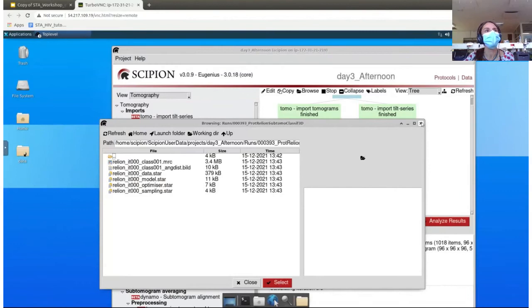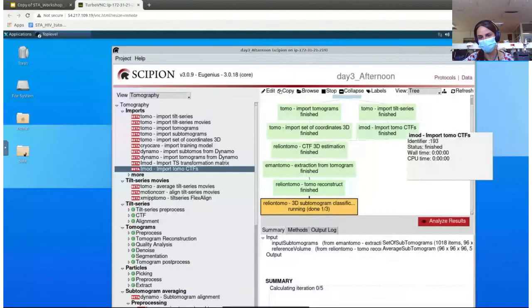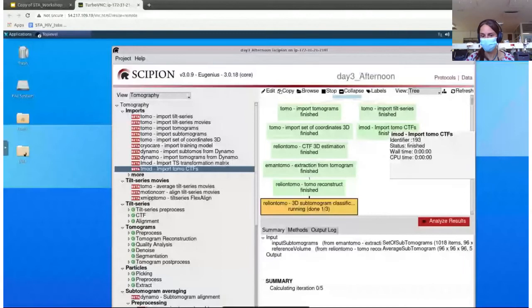Yes, so in order to reconstruct the tomograms, we perform the correction of the CTF with IMOD CTF plotter. And then we use this information to correct the CTF with IMOD in the tilt series, and then we used the program from Jose Jesus, the Tomo 3D, to reconstruct the tomogram with the SIRT algorithm. So if we have time afterwards, we will show you how to correct the CTF manually for this series, but I don't know if the protocol is too long to launch ourselves into that.